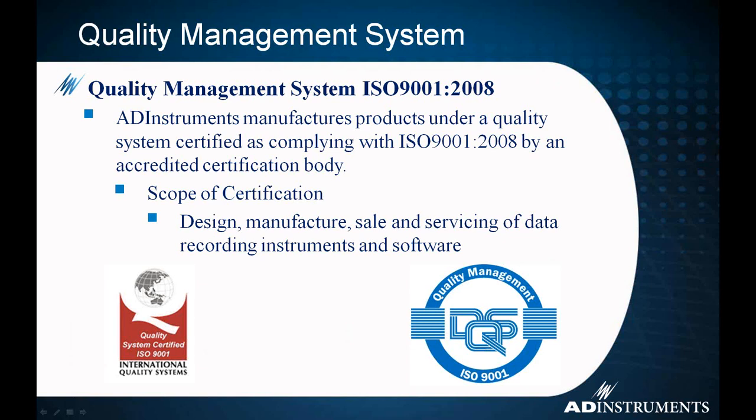Last but not least, quite often I get customers asking, how do I know what I'm reading in LabChart is actually what I'm getting into the front of the PowerLab? The way that we ensure this, we've actually been certified through this quality management system, ISO 9001. It's at some considerable expense, just to say that we manufacture, test, and service our software and instruments to a known good standard. We have proper quality measures in place so that you know what is actually going in the front of the PowerLab is accurately being reproduced in LabChart.